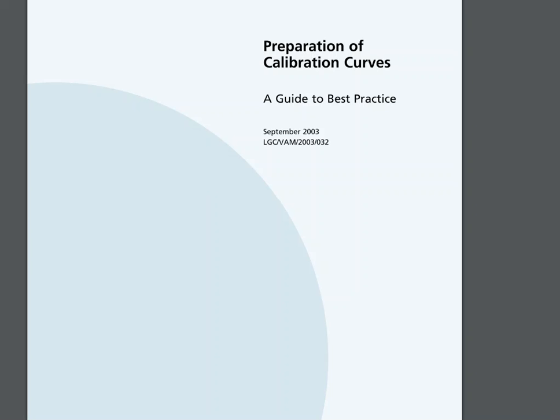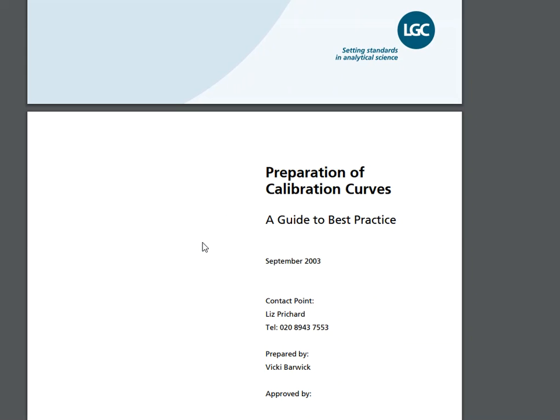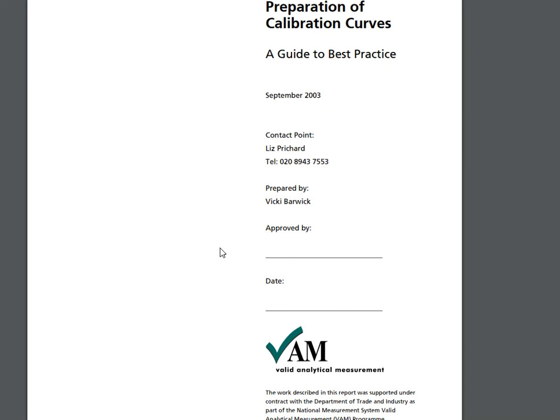Okay, so the preparation of the calibration curve, it says a guide to best practice, and it was published in 2003, but honestly, a lot of the things have not changed here. The reason that I want to cover this is because I think that it is a very good job summing up some of the common problems that happen in a laboratory and how to fix them.